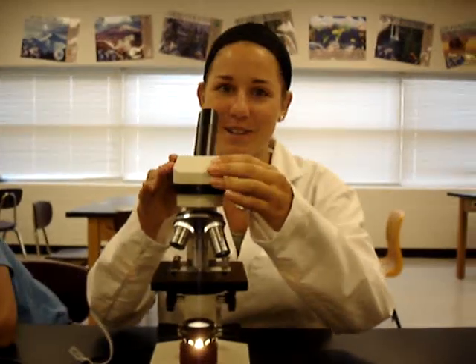Now let's turn the microscope off. Always, always, always make sure you turn it back to the lowest power before turning it off.